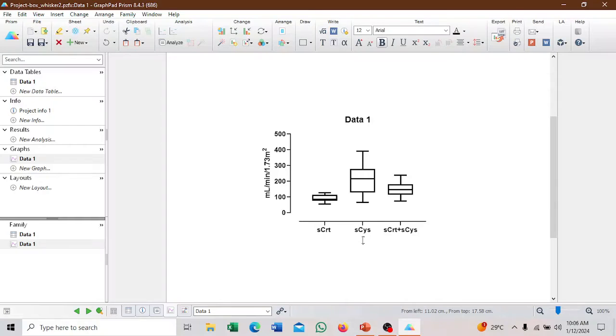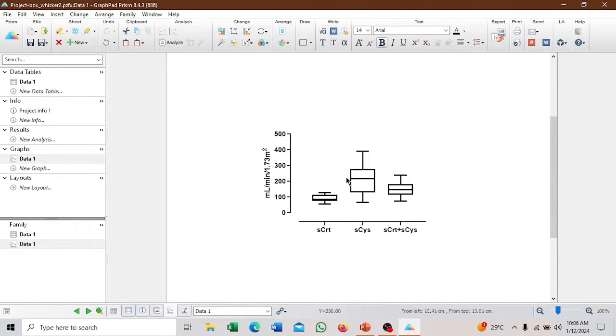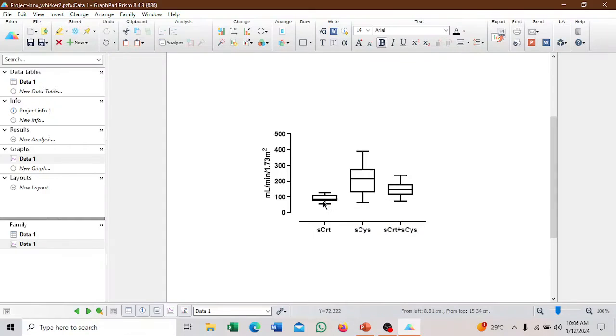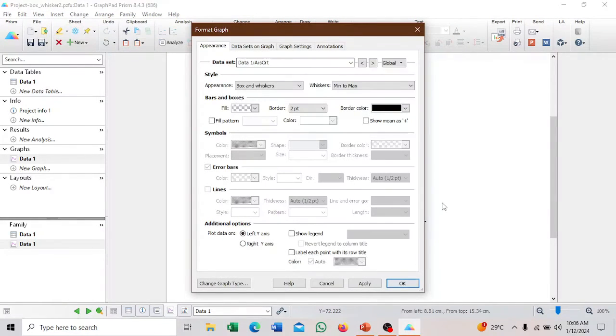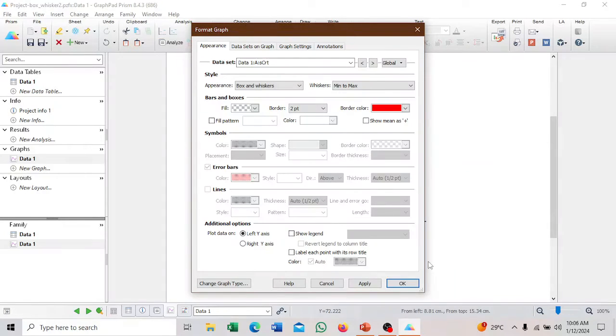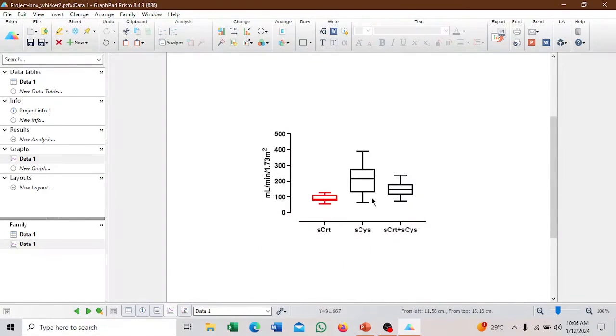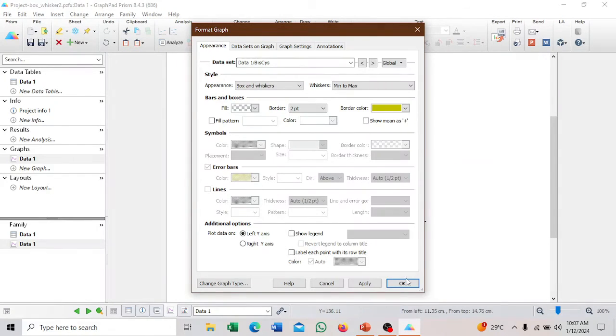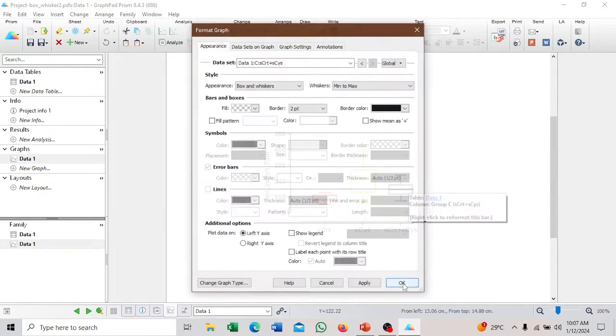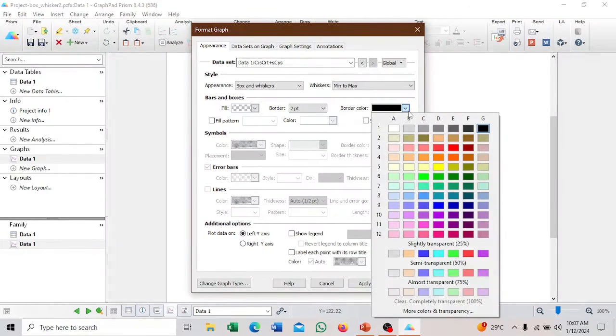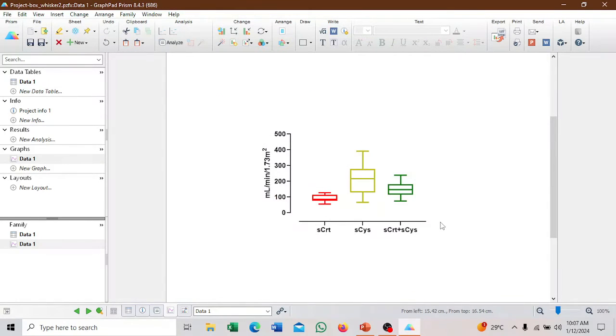We don't need a title here or here. We can try to distinguish between these box and whisker plots. They are all black, the borderlines. We can make them different to distinguish between them. We can make this one red borderline. We can make this the gold color. Then we can make this one green.